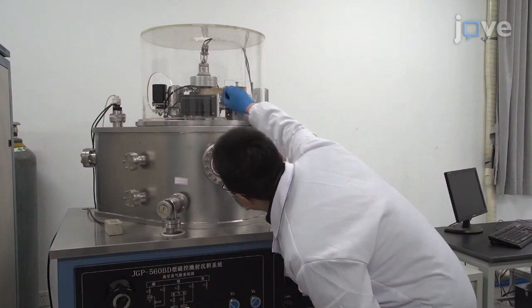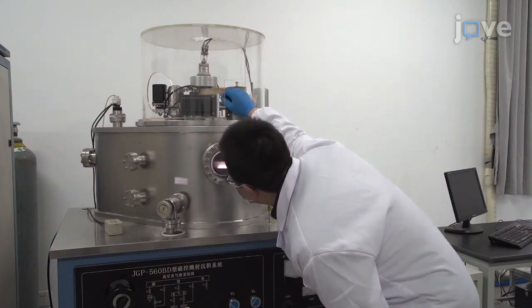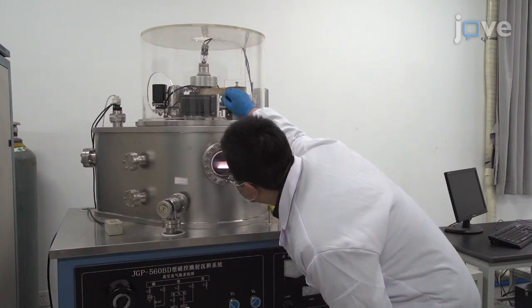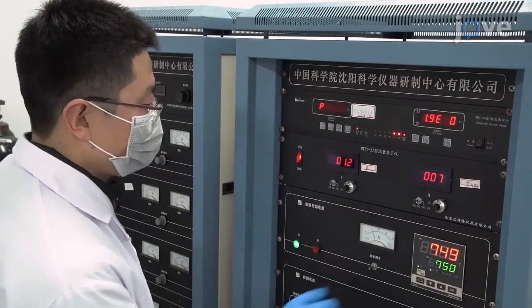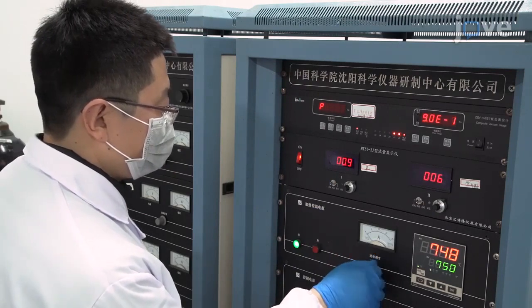This method can provide insight into film deposition area, nanoparticle growth area, etc. It can also be applied to metal film deposition, metal nanoparticle deposition, etc. This method will allow researchers to become familiar with vacuum equipment and learn more about film growth technology.